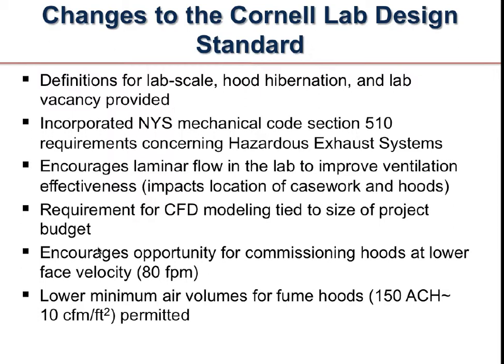We inputted the New York State Mechanical Code Section 510, which is something that I wanted. This is requirements concerning hazardous exhaust systems. We wanted some definition for what a fume hood is supposed to be used for. There are certain things that we cannot emit.